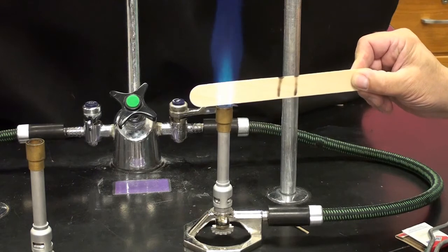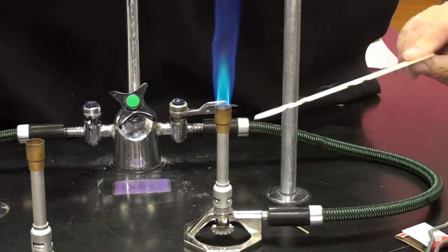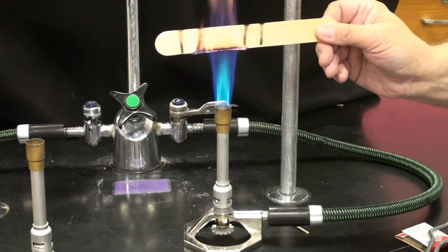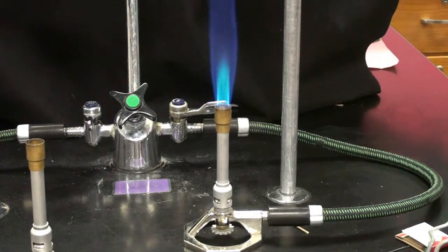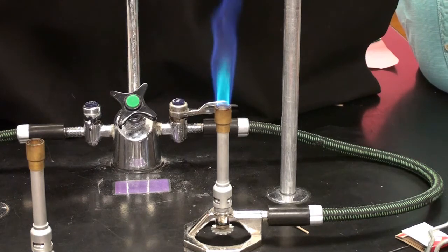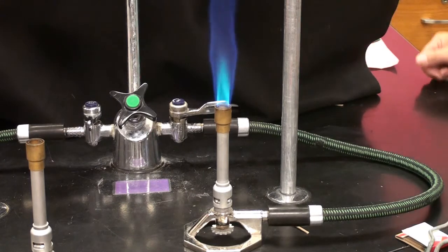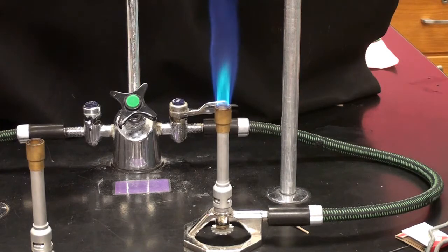Just like before, I can go like so, right? I'm getting kind of like what we got before, burning on the outside of the flame. Up here at the top part, okay, pretty different. Okay, above that blue cone, I'm getting something very different on that one. I just stuck that over there in the sink. And above that blue section over there, what I find is that the whole thing started to burn. It didn't have a cool inner portion and a hot outer portion.